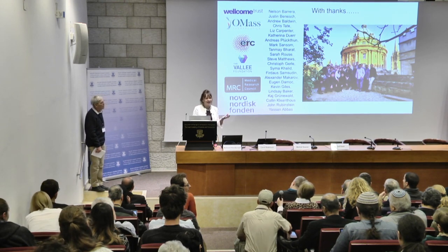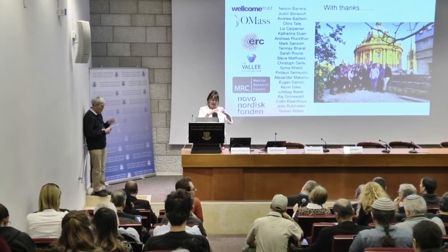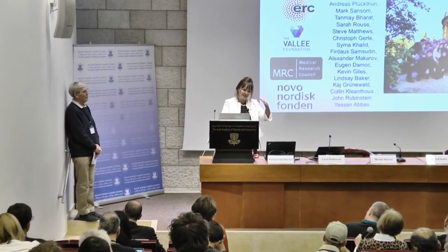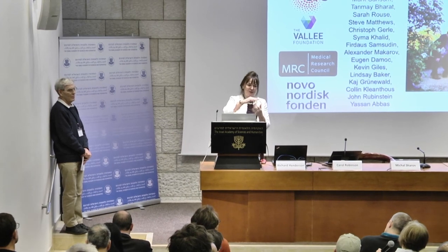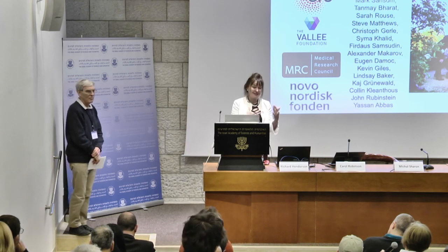Yeah, the DnaK I'm perfectly happy with, and we don't say that they're definitely the right way round. They can invert, of course, so you can get both sides of the membrane exposed. And I think the chaperones actually act as chargeable handles to help pull out the complexes, because quite often we don't see it without its chaperone, and there must be heaps of it there without its chaperone.